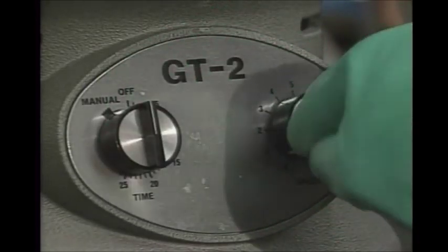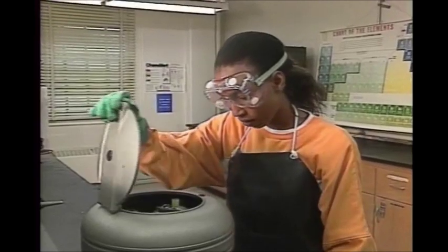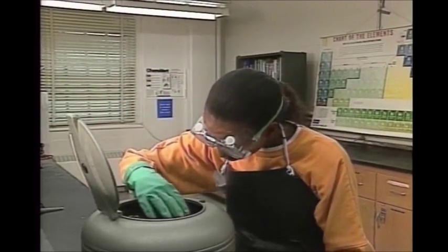When it's finished, turn it off. Then wait till it stops spinning on its own. Never try to stop a centrifuge with your hand.